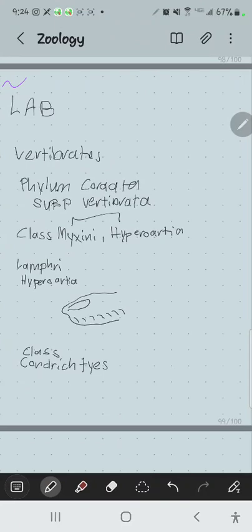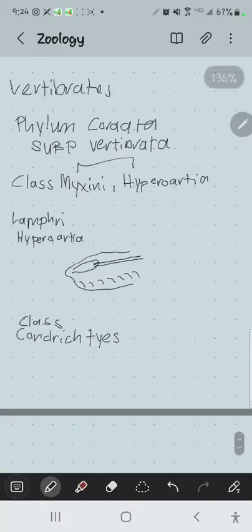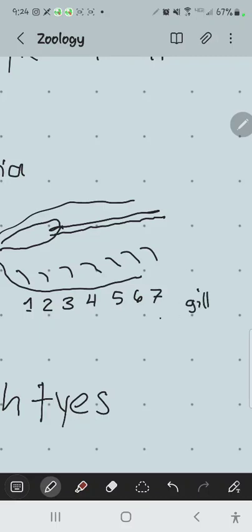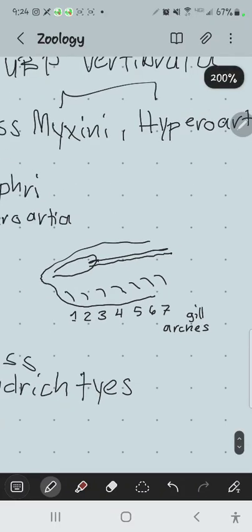There's like a shark there. And what they have going on is they have a cranium, and a backbone, the first vertebrae. Okay. And the jaws basically are made up of two separate arch structures that work together. There is what's called the mandible.